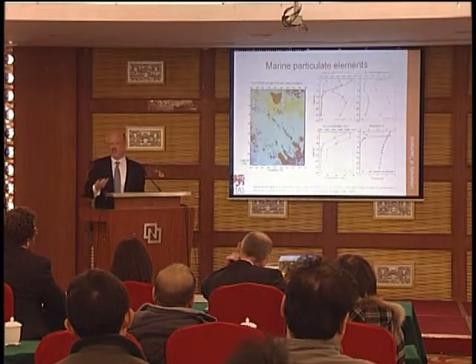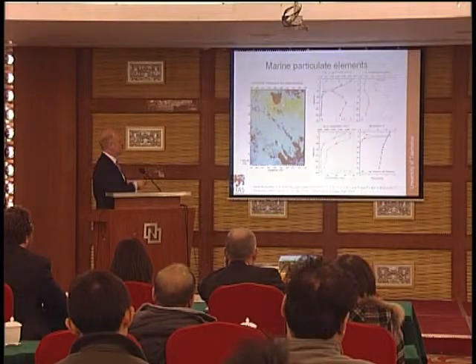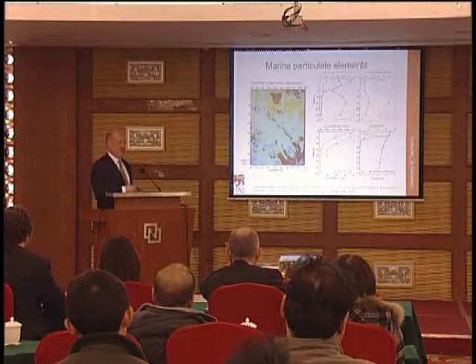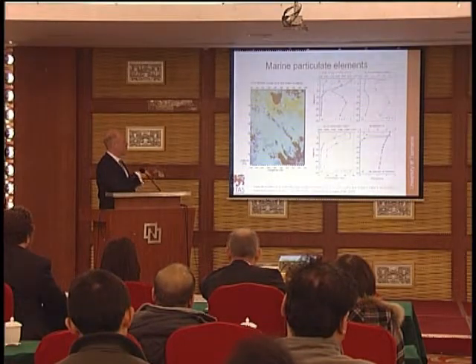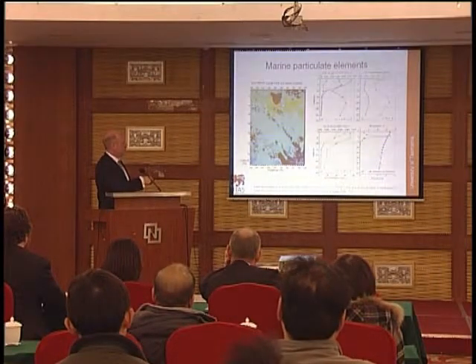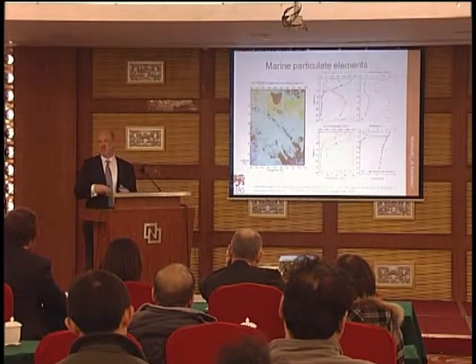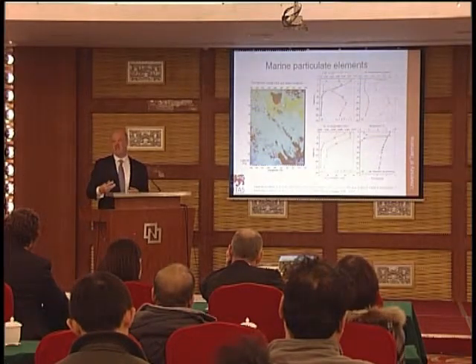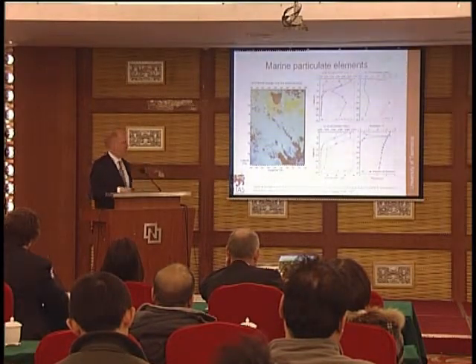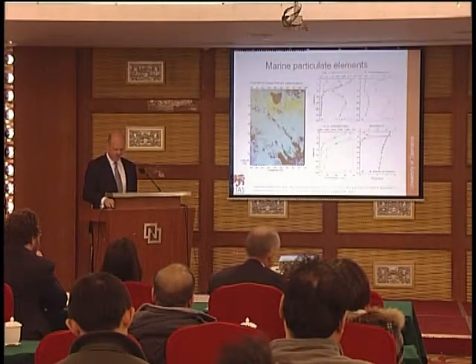I'm not an oceanographer, so I'm not going to try and interpret what that means, except to say that the different profiles represent the processes that the elements are associated with. It tells us where they come from, whether it's falling from the sky, whether it's coming up from the ocean, whether there's biological activity here at around 50 metres depth, and some of these metals are associated with that. Some of these metals show profiles that indicate remineralisation, life and death, and sinking of the organic and metal matter to the ocean floor. So it's really powerful information for our oceanographers.